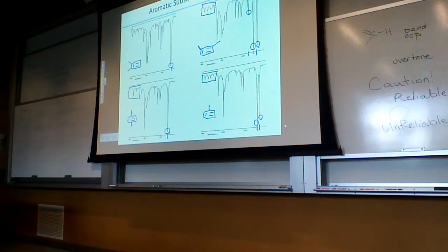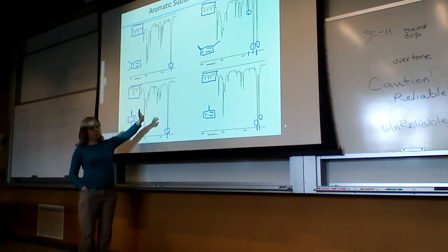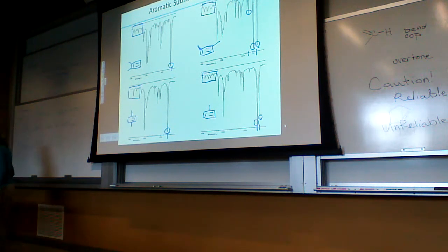And they have a blow up of those. The more reliable of these two is actually the regular peak, not the overtone. But these can sometimes get shuffled in with a lot of other things that absorb in this region, so it can be rather complex to interpret. Yeah, you gotta be careful with these.